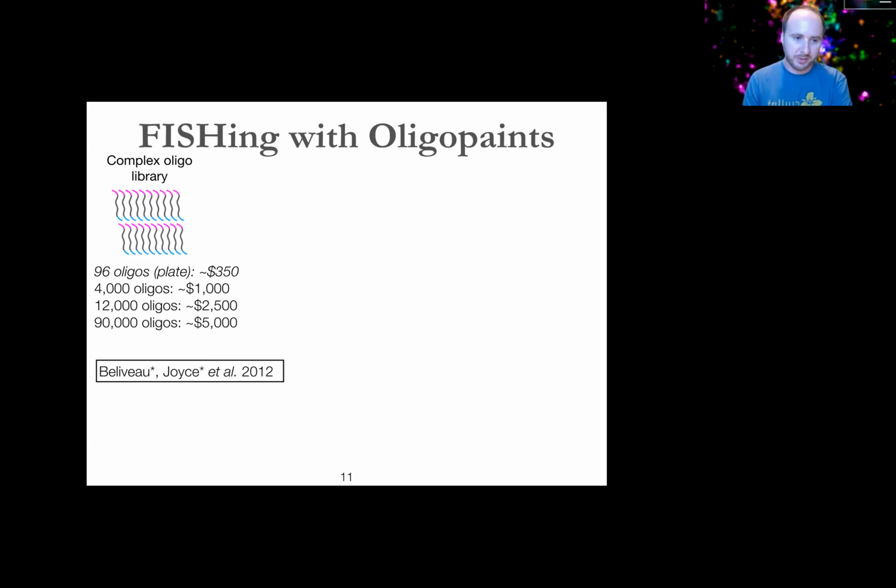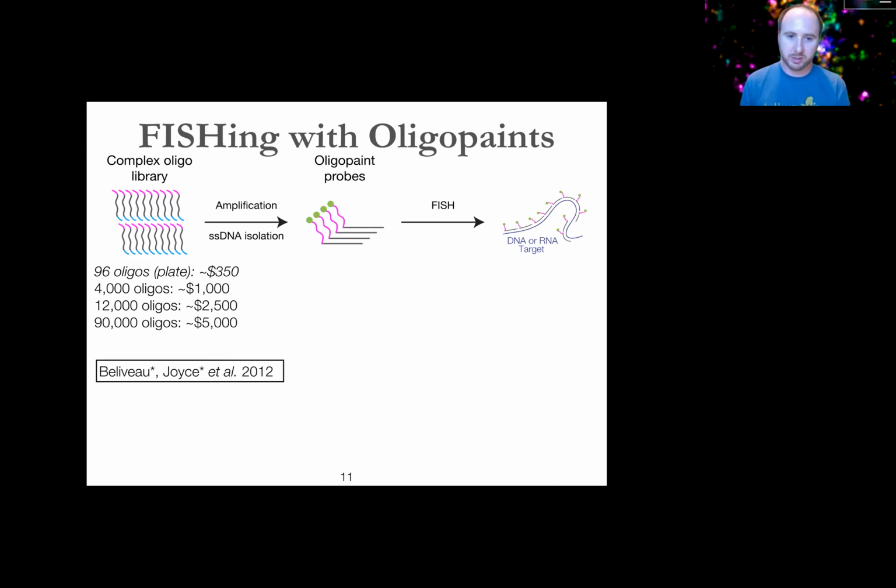The fundamental difference between the 96 plate oligo that I have italicized and all the other ones here is that the amount of material you're getting from these array synthesis products that are cleaved into solution is very, very low. So you're getting less than like attomoles or something like that per species. So in order to be able to turn that into enough usable material to actually do an experiment on a TC sample or a tissue section, you need to do some molecular biology.